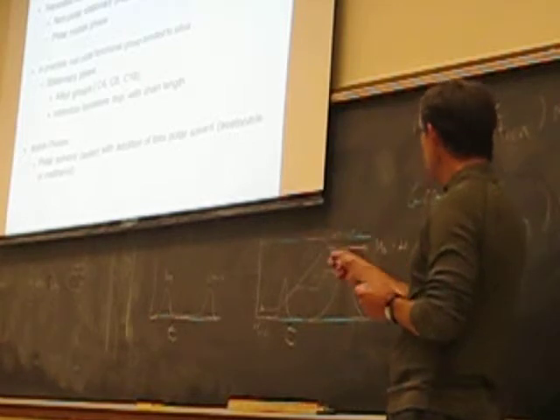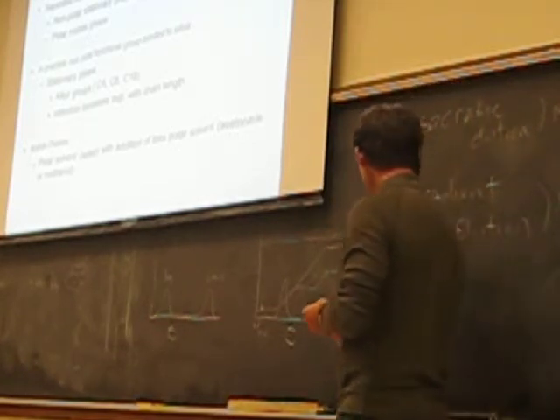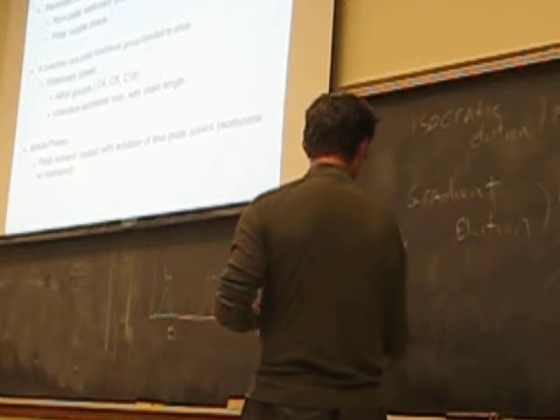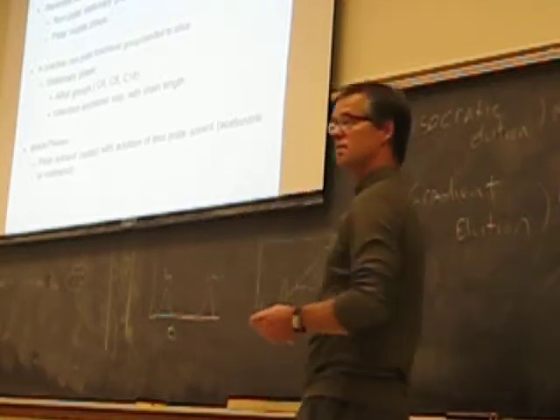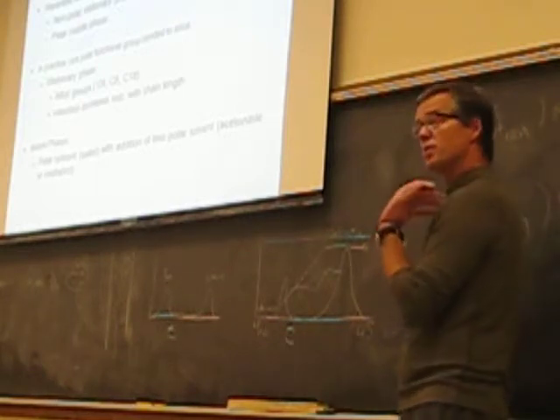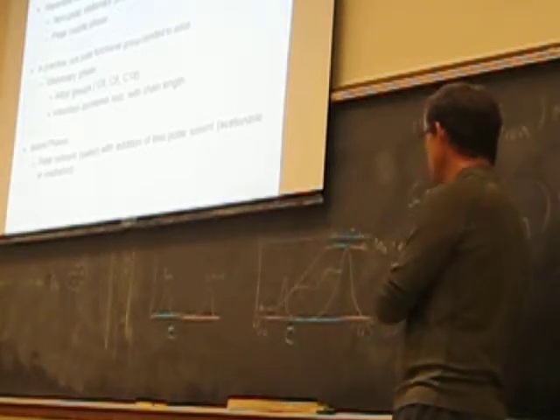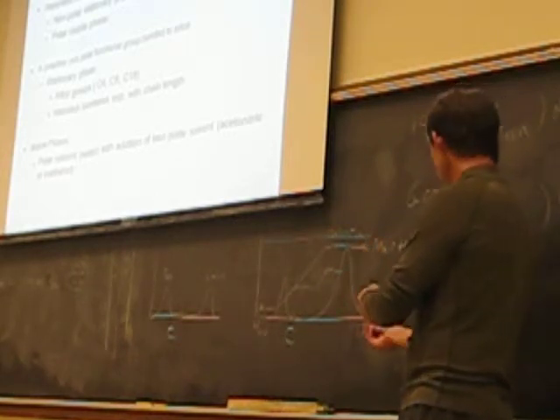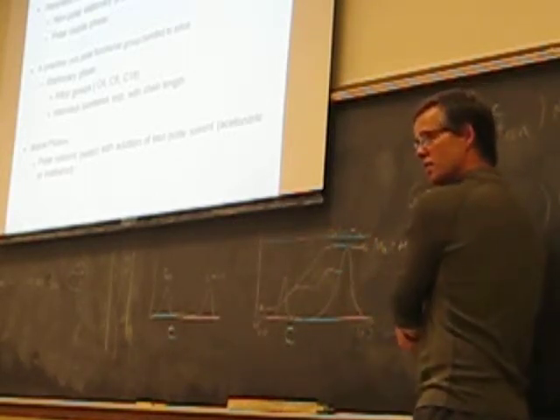Now the problem with these kinds of elutions is that these typically take 45 to 60 minutes, which is kind of a pain in the neck. It's a long time. But if you're really interested in isolating these compounds, oftentimes you're not just detecting them. You've got a fraction collector at the end of the eluent, and you're collecting.